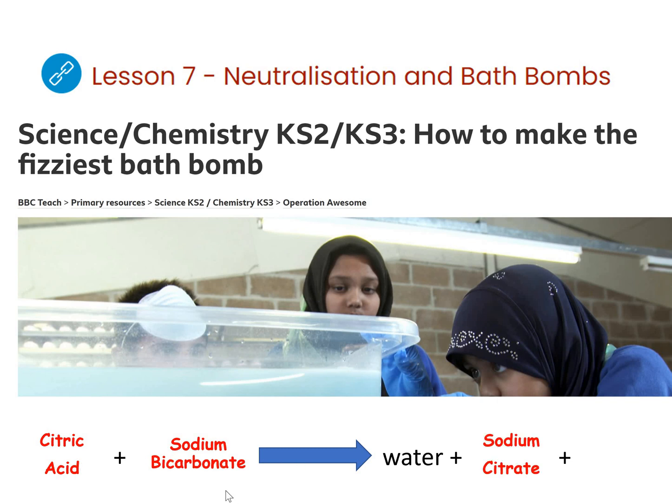So because we've got citric acid here, you don't need to know this, but it becomes sodium citrate. And like before, because we've got the bicarbonate, carbon dioxide gas is being given off. So it's still a neutralization reaction.